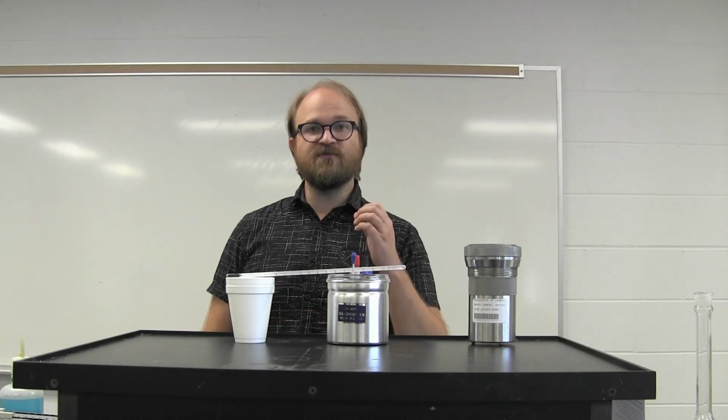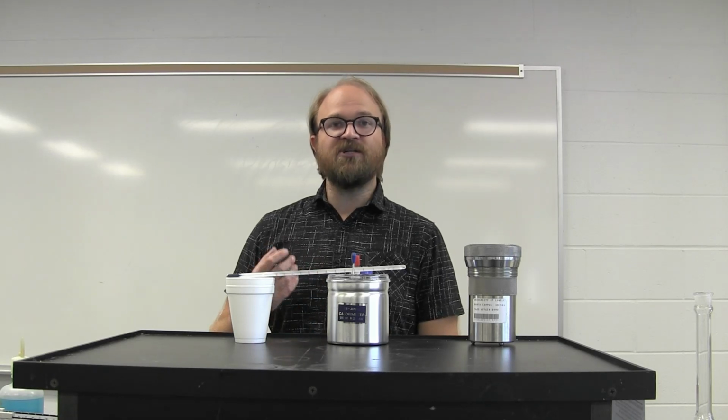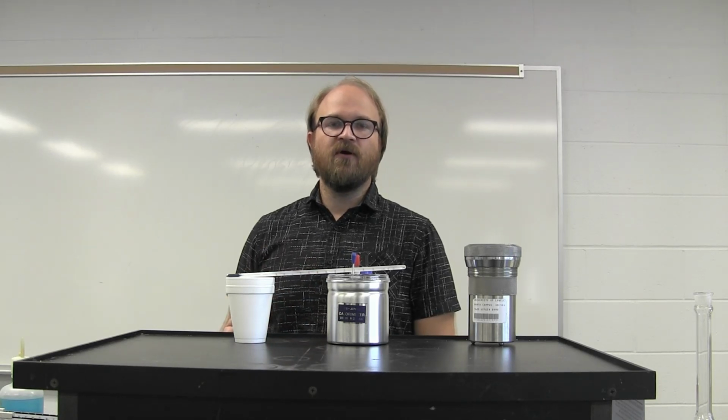Calorimetry is the measurement of heat energy, or enthalpy, that's associated with nearly every chemical reaction or physical process. When you're measuring this heat, or measuring this energy, you're not measuring it directly from the reaction itself. You're using known materials and measuring the change in temperature.